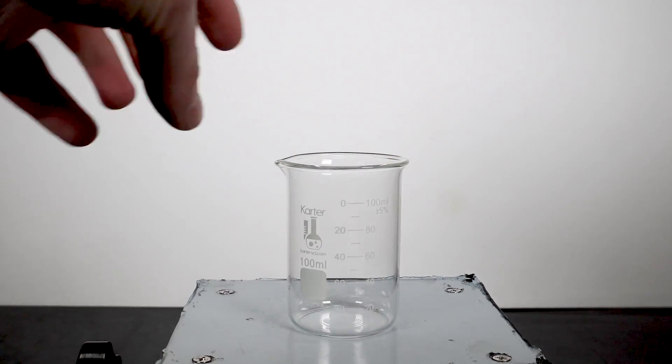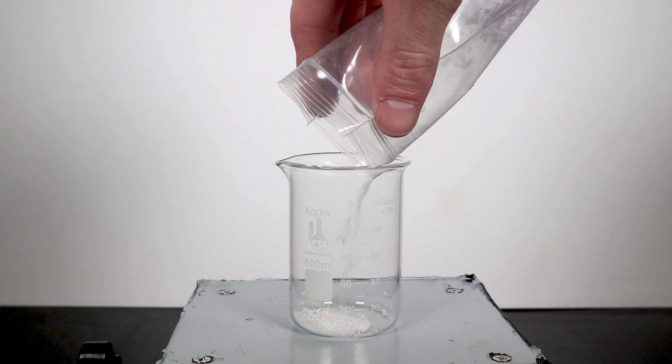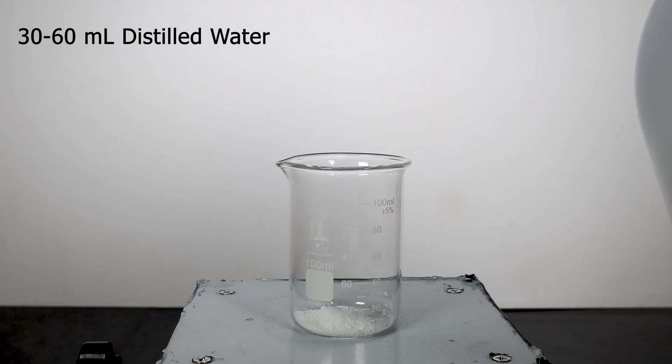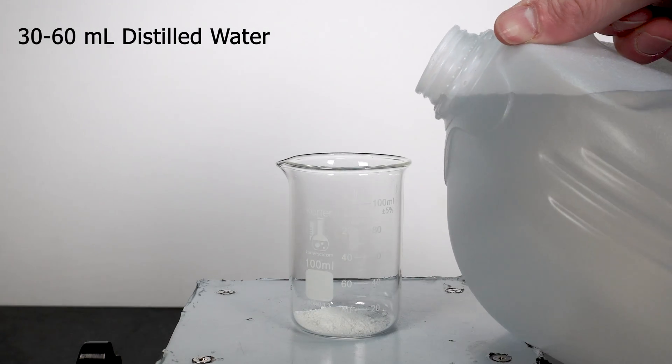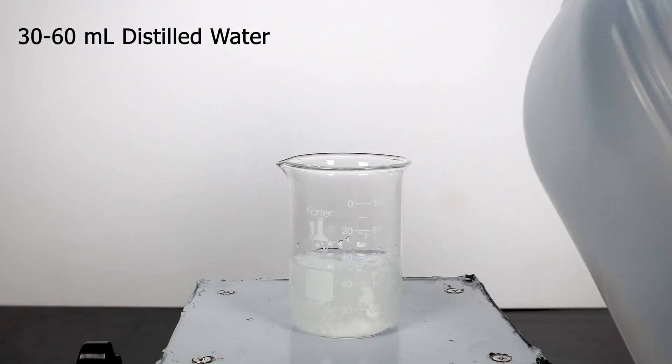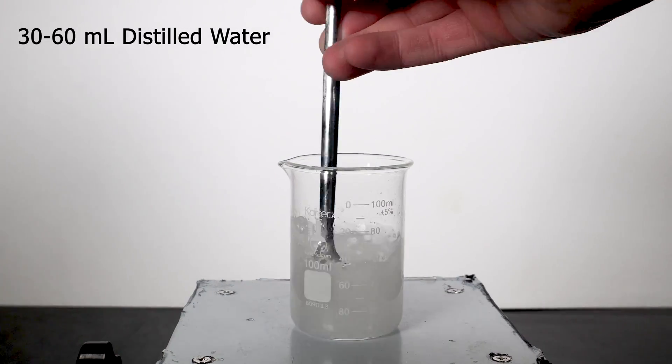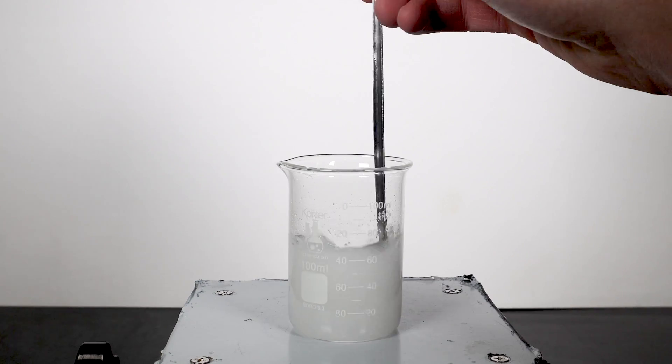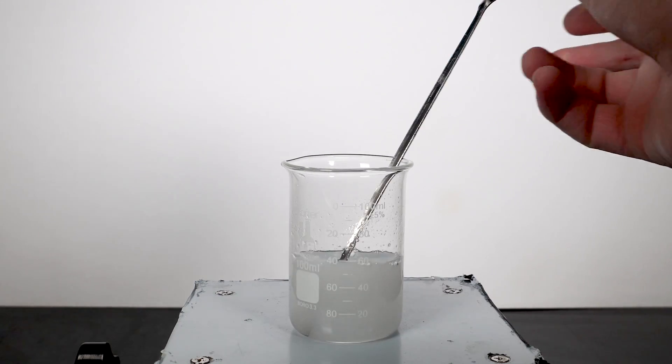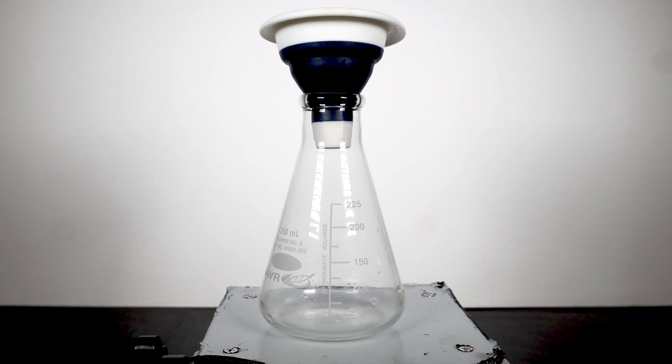Next, we will need to pour all of the powder into a beaker, and top it off with anywhere between 30 and 60ml of distilled water. From here, we just need to mix everything. Vitamin C is pretty soluble in water, but a lot of the pill filler will be left behind. Once everything is mixed for about a minute, we can move on to filtering.